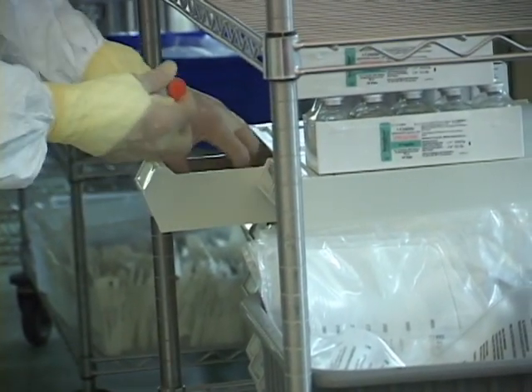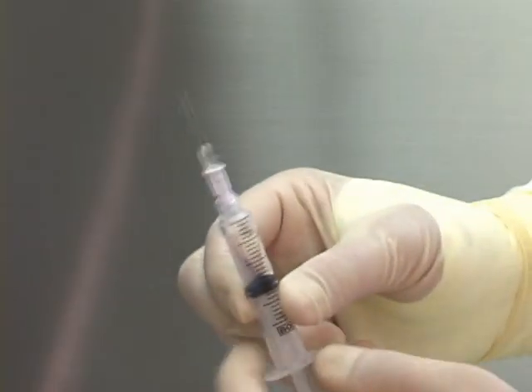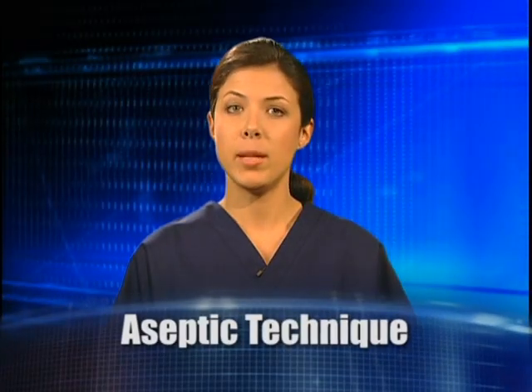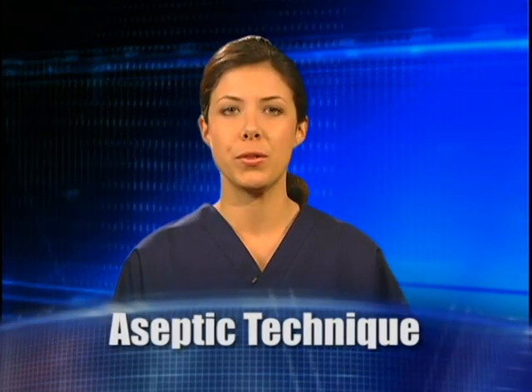Secondary engineering controls are only part of the overall process of compounding sterile preparations. Next, we'll discuss aseptic techniques and practices used within the various primary engineering controls. Aseptic technique, that is, methods used to manipulate sterile preparations so that they remain sterile, should be used while working at any of the primary engineering controls. The following principles are important to understanding how to use aseptic technique properly within a primary engineering control.